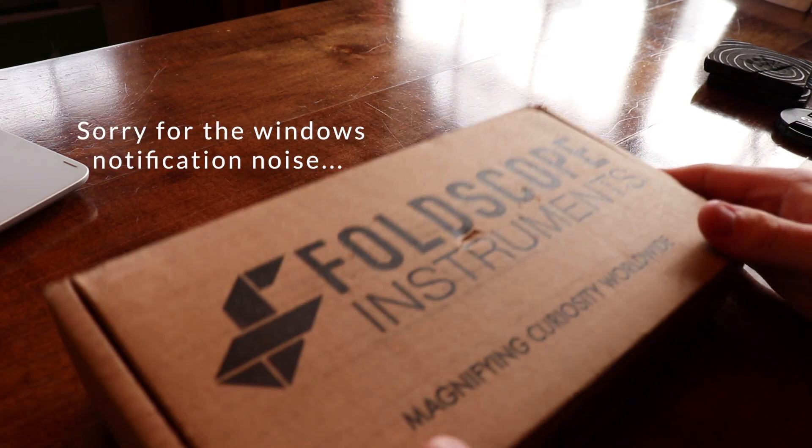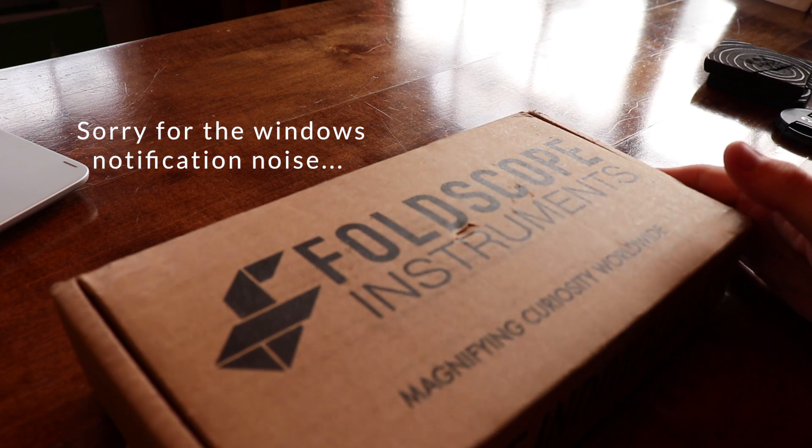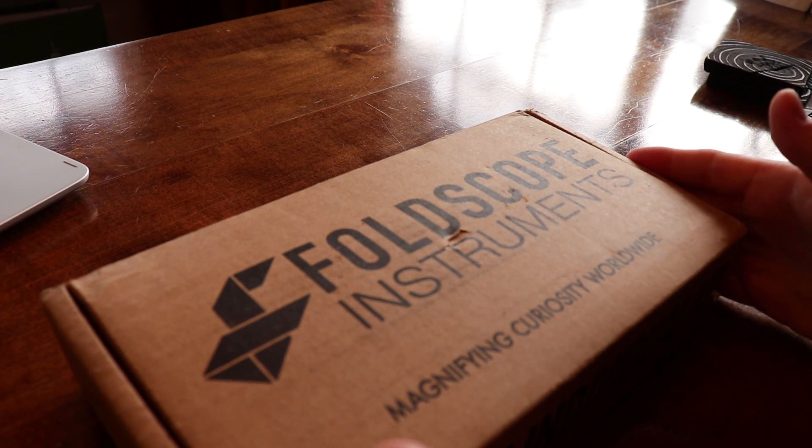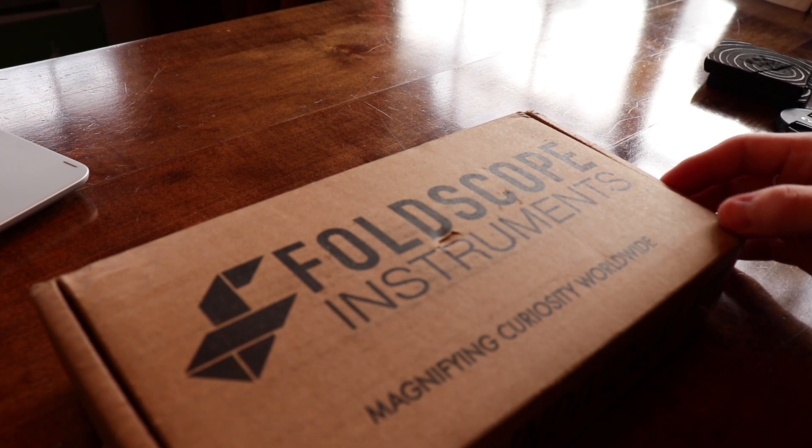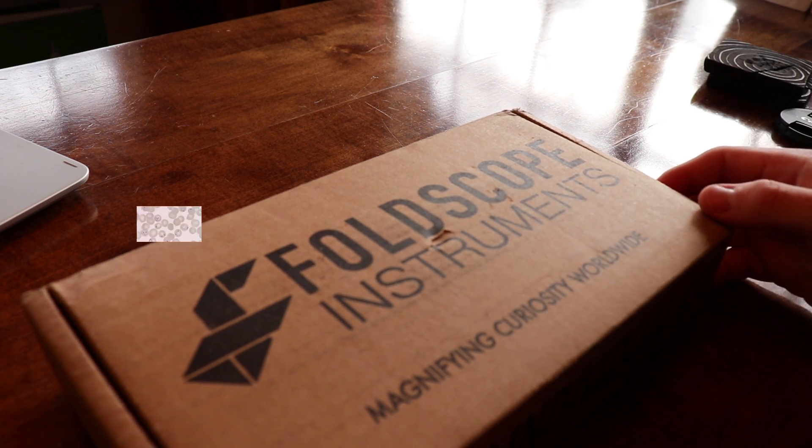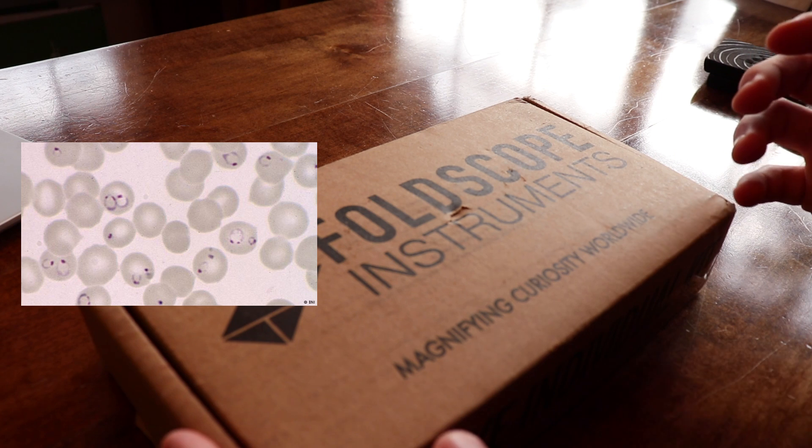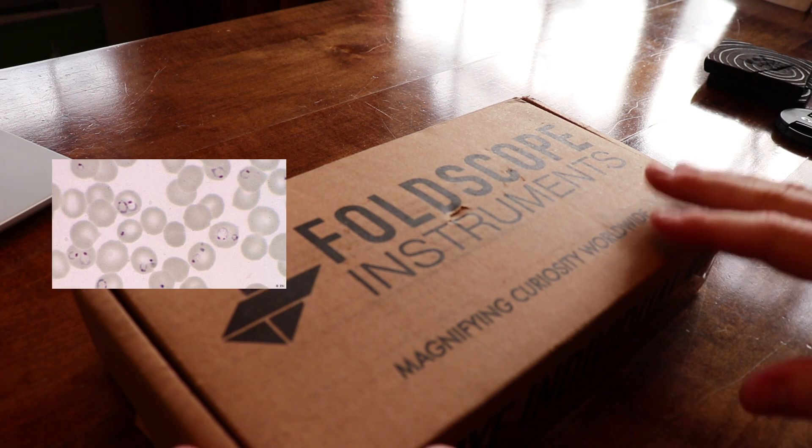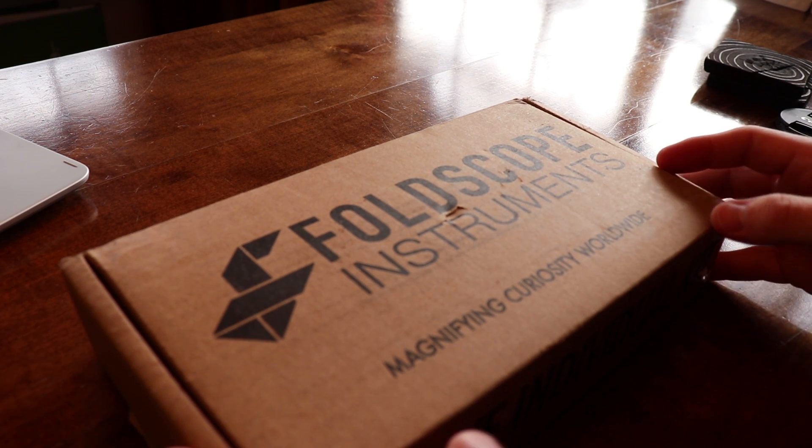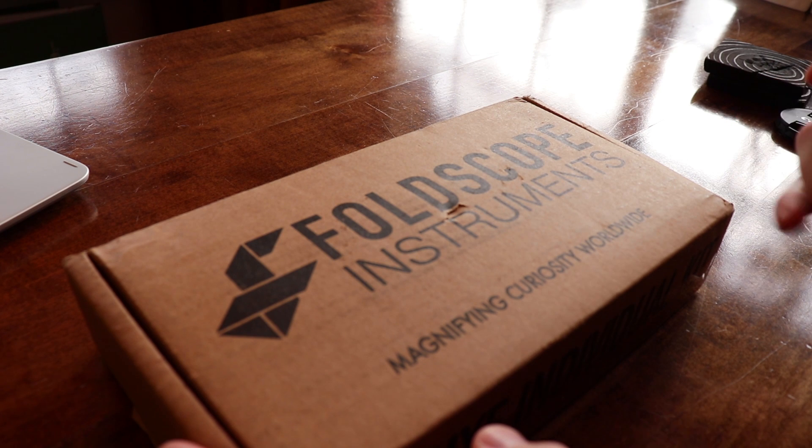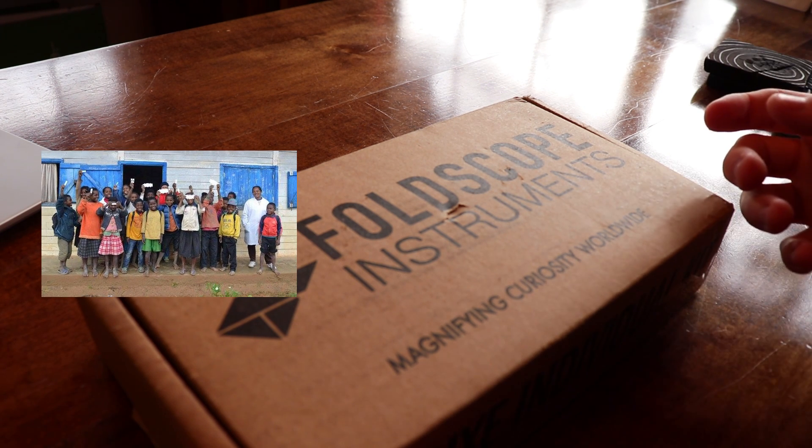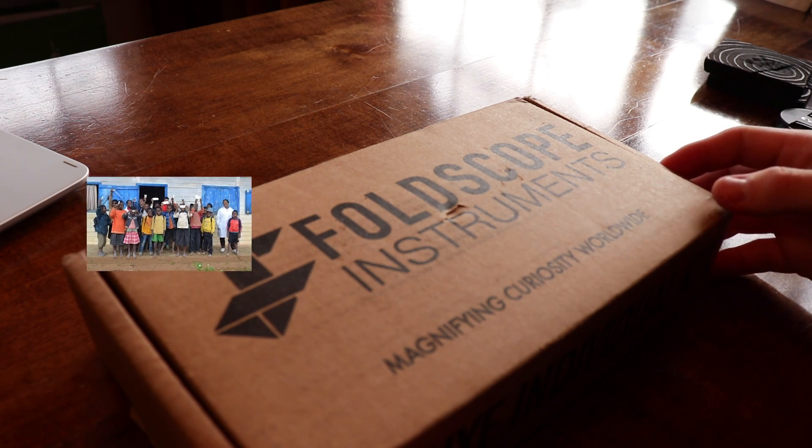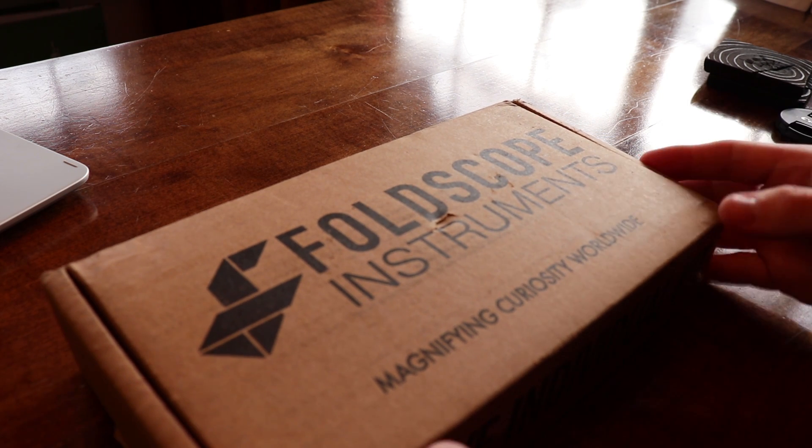If you don't know what the Foldscope is, it is a microscope that was created to help diagnose malaria in third world countries. The ones for third world countries are made completely out of plastic and paper, primarily paper, and they're incredibly cheap.